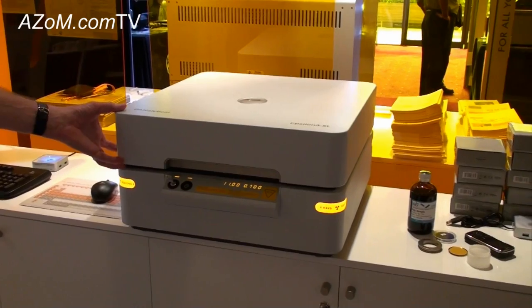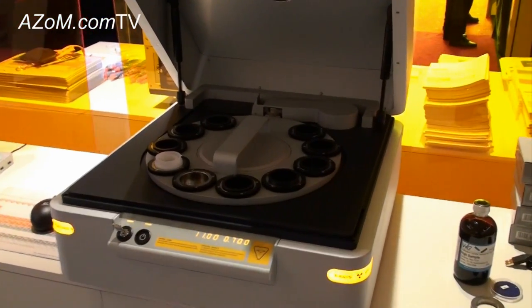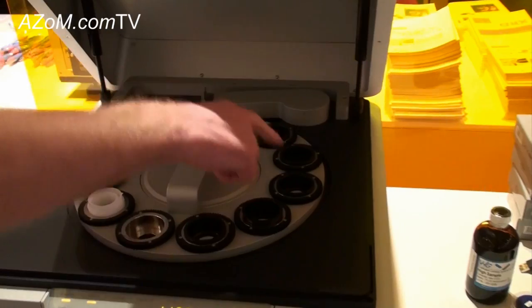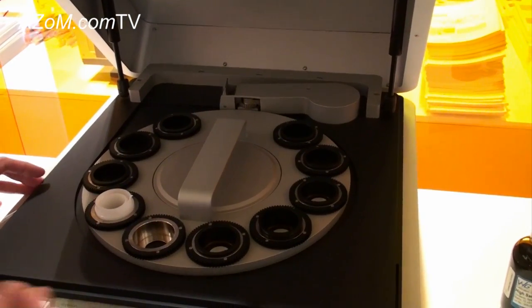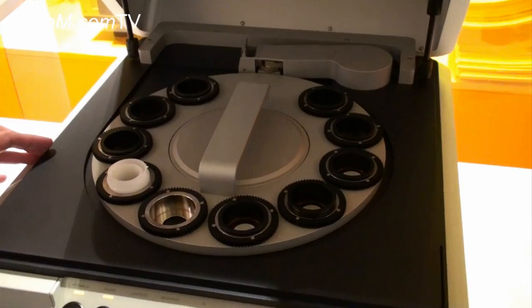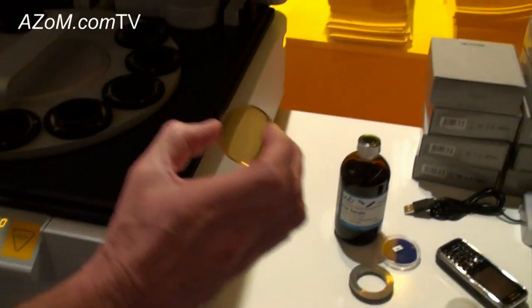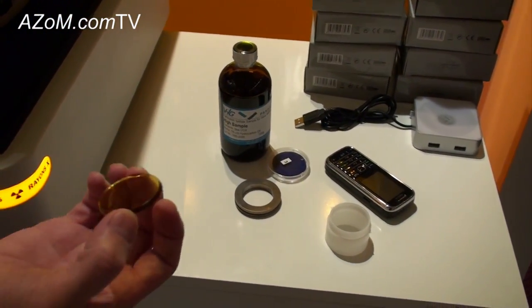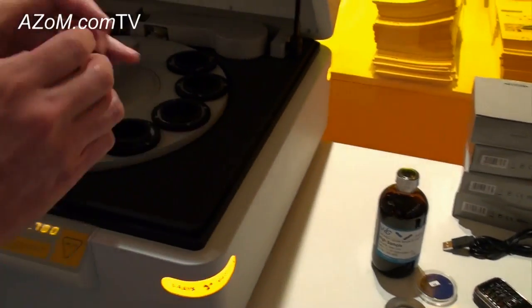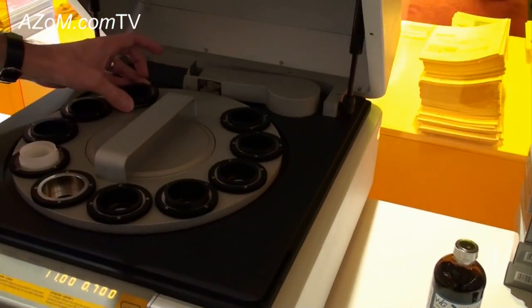The system, as you can see, is easily opened. It has a sample carousel, so you can mount a number of samples, which enables you to do unattended batch analysis. The types of samples that we can accommodate — if you can see here, for example, this is a fused glass bead of cement. The sample will be placed into the holder like so, and loaded into the instrument.